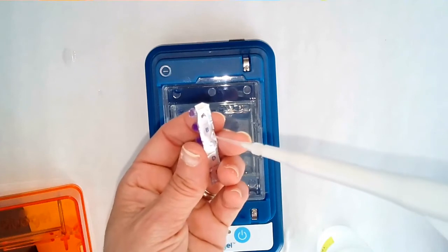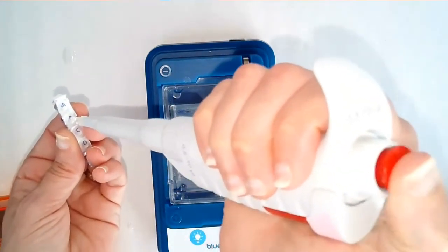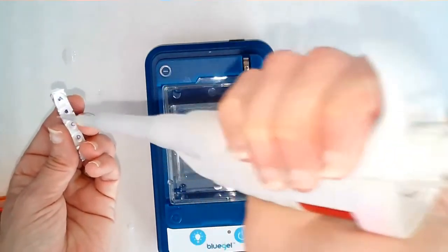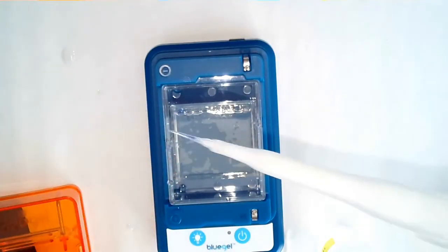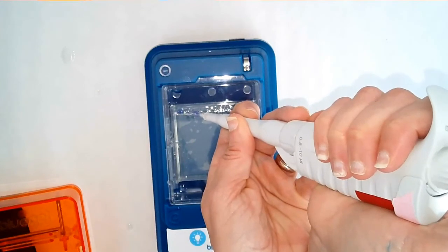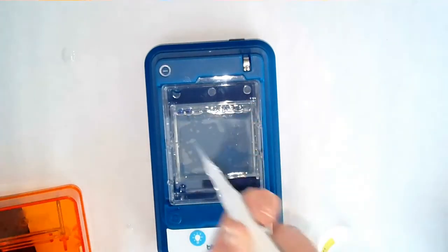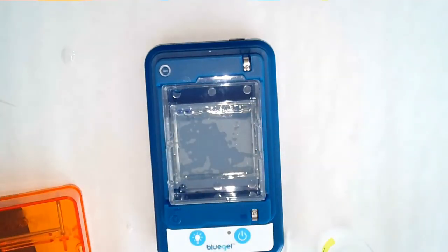So one more time. Now I have a fresh tip on person B. I will mix it gently by pushing my thumb up and down to mix in the restriction enzymes with the DNA. Okay, thumb down to the first position. Puncture through, extract just the 10 microliters, and now you're going to well 2. Okay, after you load this well with DNA B, the next person will do DNA C into well 3, and so on.